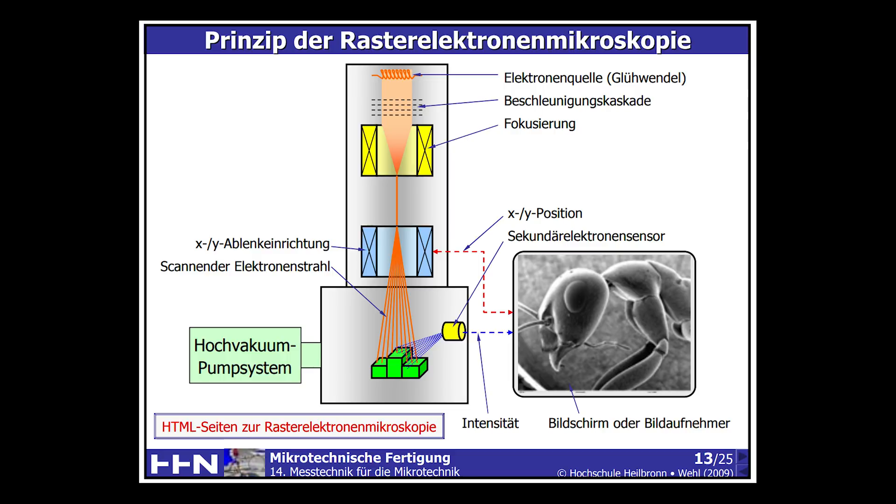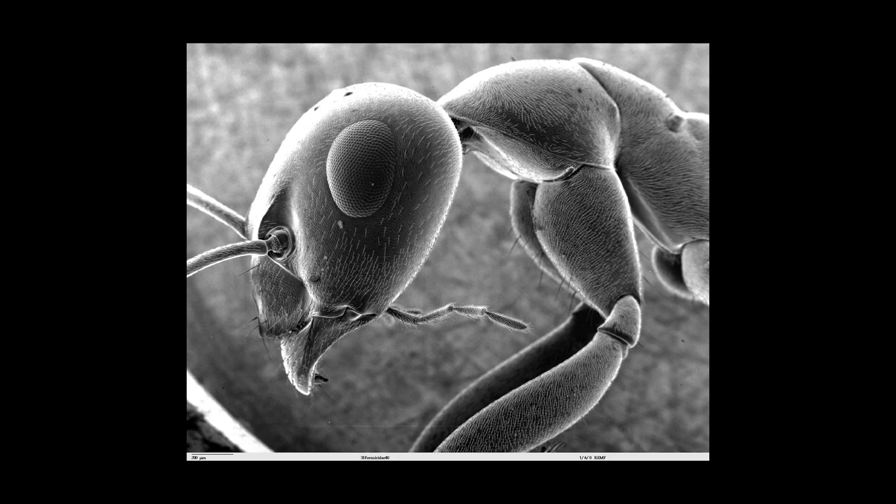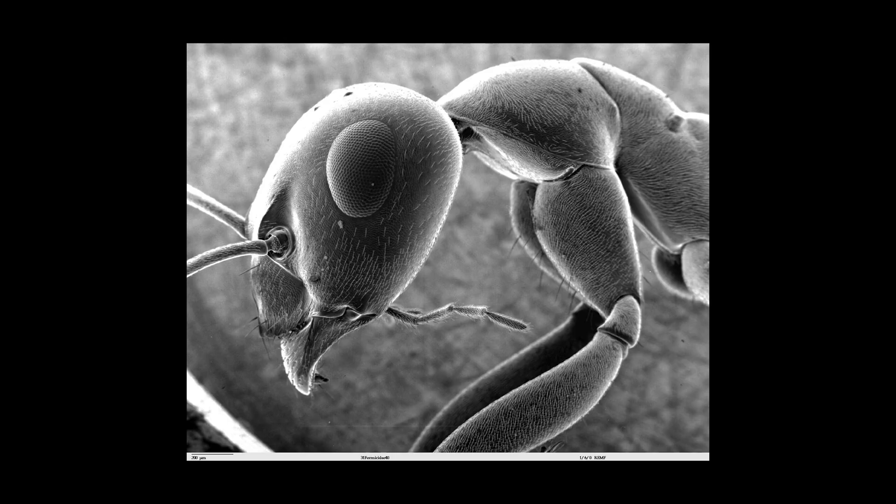This is what you typically use for scanning insects — you can get really impressive footage — but to do that the surface has to be electrically conductive. For insects you have to coat them first with platinum or gold, just a very thin layer. Thankfully the CPU is already electrically conductive because we have a lot of copper inside the PCB and several different types of metals inside the CPU itself on top of the silicon, so we don't have to do any coating for the CPU.